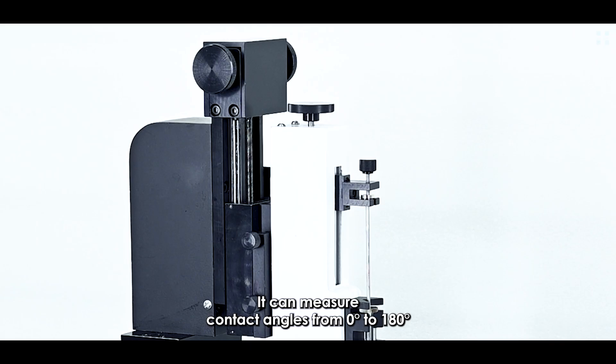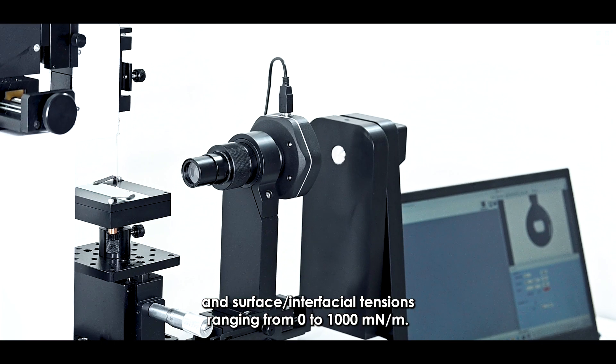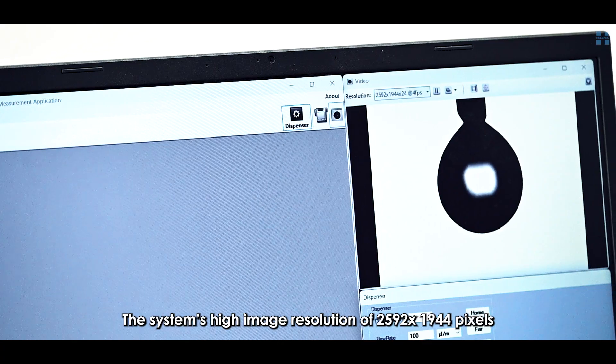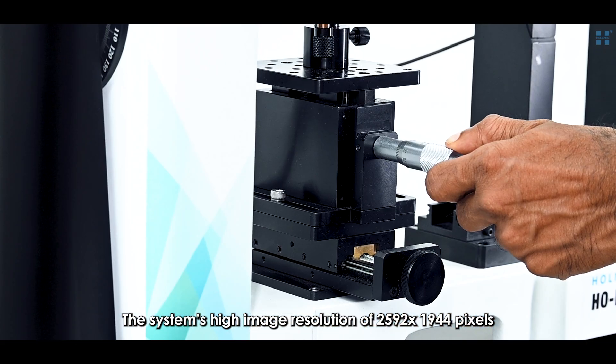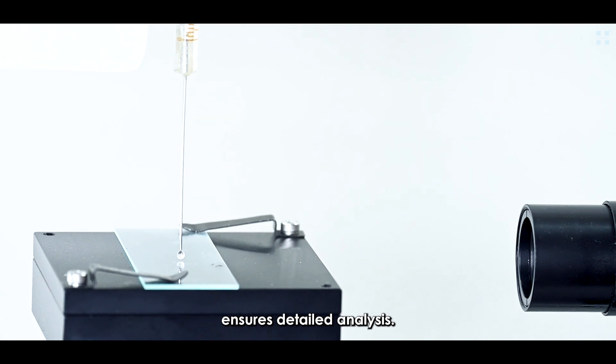It can measure contact angles from 0 degrees to 180 degrees and surface or interfacial tensions ranging from 0 to 1000 mN per meter. The system's high image resolution of 2,592 by 1,944 pixels ensures detailed analysis.